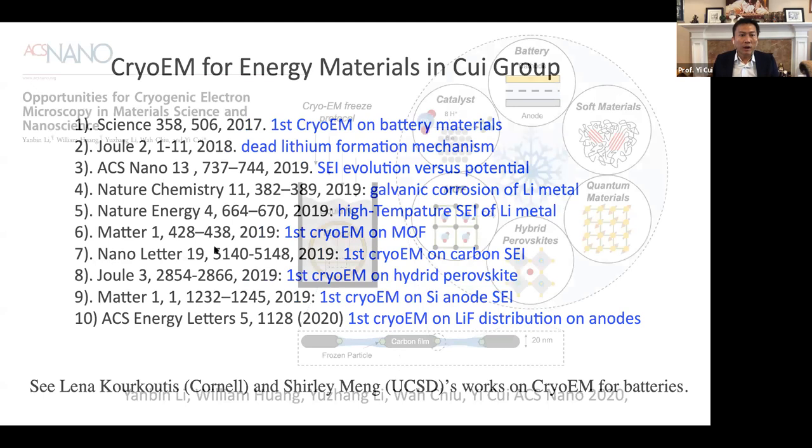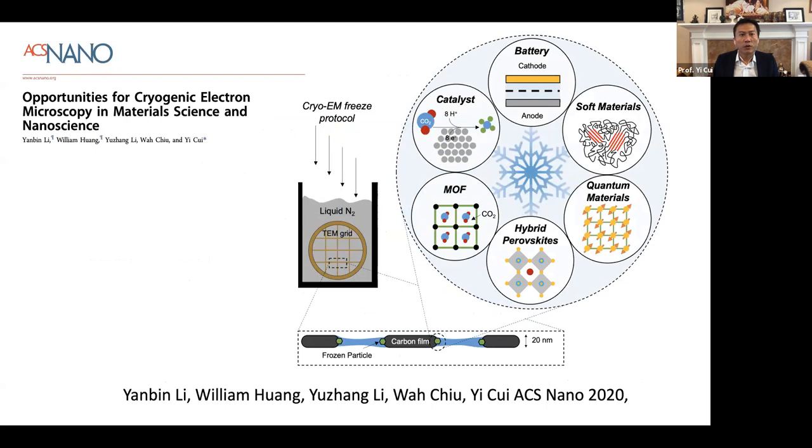I also want to bring your attention to the cryo-EM perspective for materials and energy science and also nanoscience. In this perspective article, together with Vav, we summarize many exciting directions, and I'd like to encourage you to read about them.